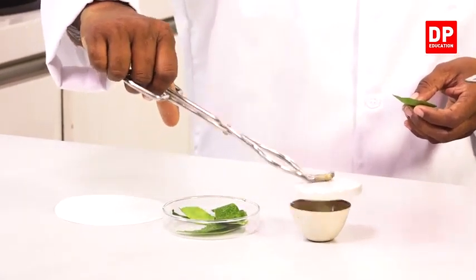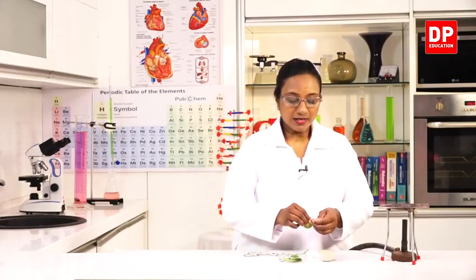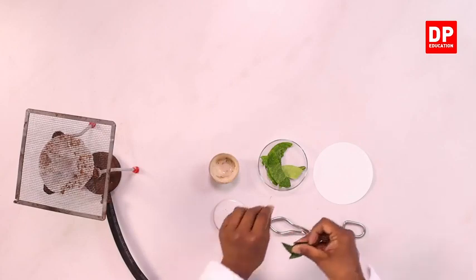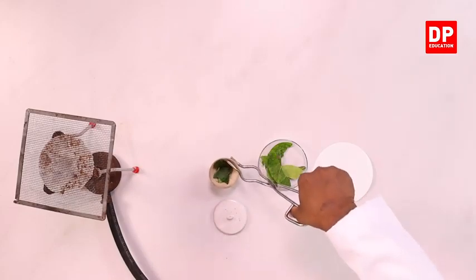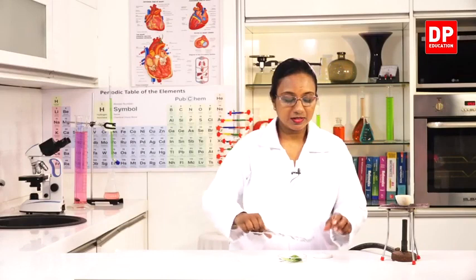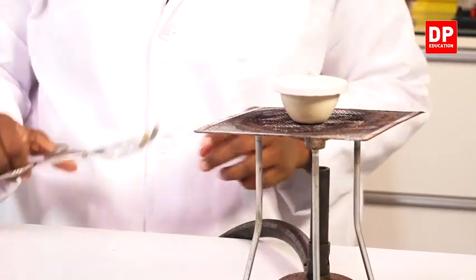I will remove the lid of the crucible and break these leaves into pieces and put it into the crucible. Place it on the wire mesh of the Bunsen burner and place the lid.